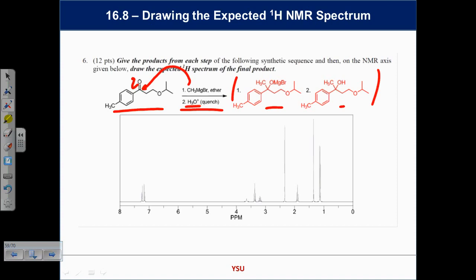It's usually, okay, I'm going to see a singlet for that. I'm going to see a septet for the CH3 group. So, sorry, you'll see a doublet for the CH3 groups. You'll see a septet for the CH group. You'll see a triplet for here, singlet for here. It won't contain doublets of bananas. It really won't. It'll be fairly simple with doublets and triplets and quartets and septets, signals that you've seen before. But if you can't do that part of the problem, you can't do that. So that's the type of question that you ought to be comfortable with and start to get used to.